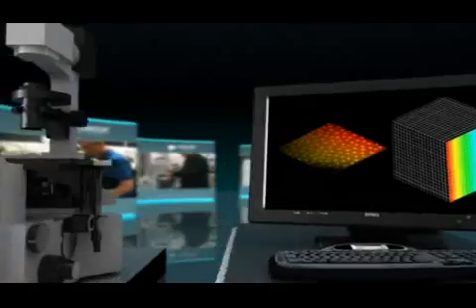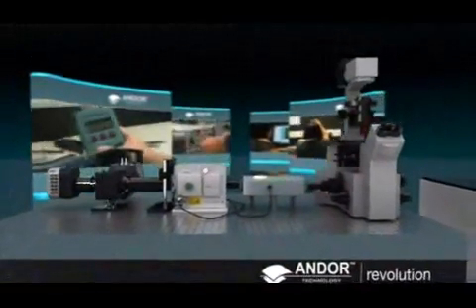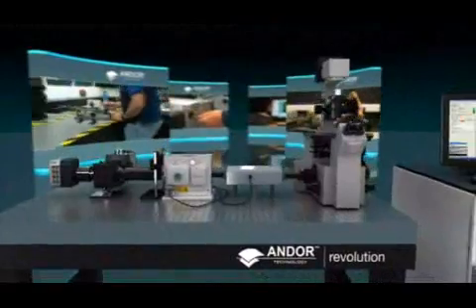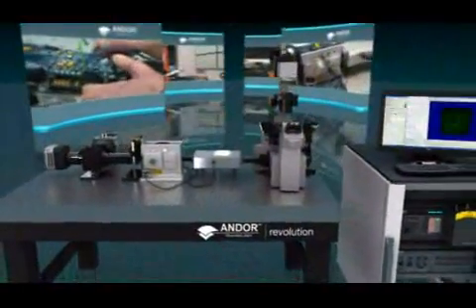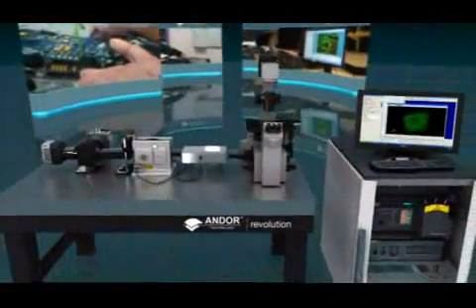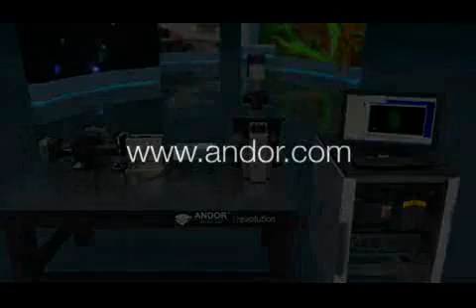Revolution systems provide the best in Confocal, TIRF and FRAP laser microscopy for live cell imaging. Discover new ways of seeing and visit www.andor.com to find out more.